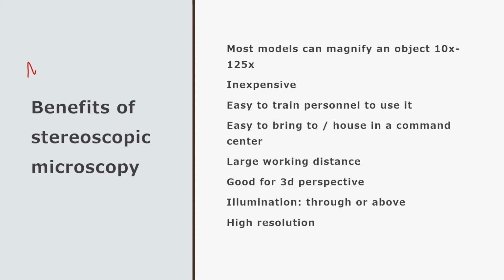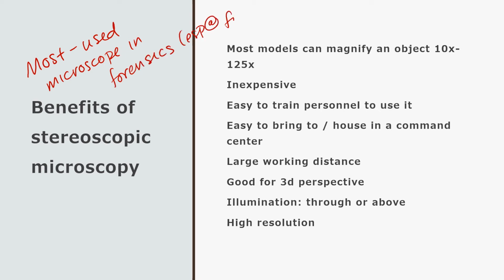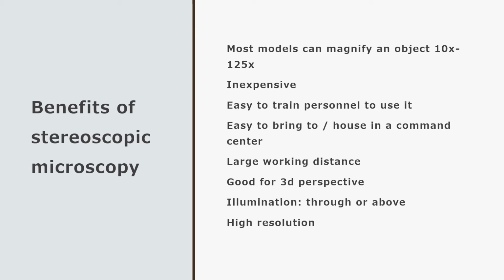This is the most used microscope in forensics, especially in the field at the crime scene, by far. Many of you have used a compound microscope in high school or middle school or something in lab. You may or may not have used a stereoscopic microscope before.